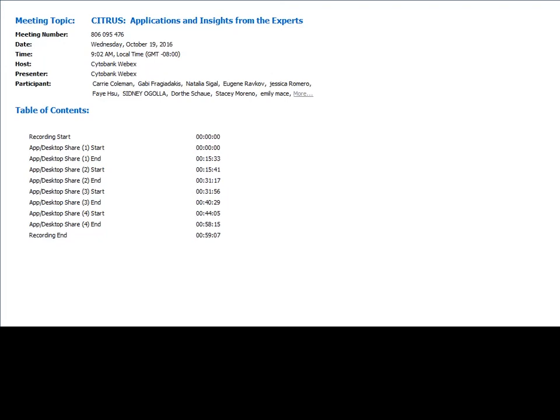The second blocker that I noticed was that the process of identifying populations to inspect for biomarker potential is manual gating. And manual gating is incredibly powerful in that it makes use of a decade of immunological knowledge. But what if that informative population that you're looking for is one that we don't really know exists? So how would we find it? So those were two big challenges that I was trying to understand how to overcome to enable biomarker discovery.